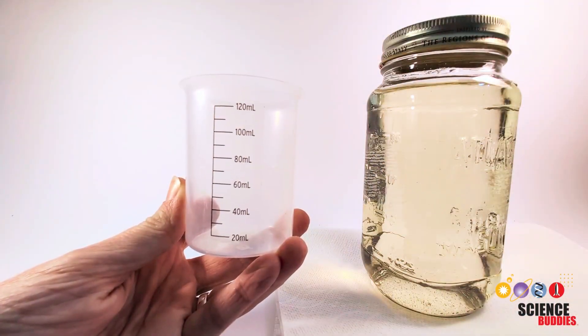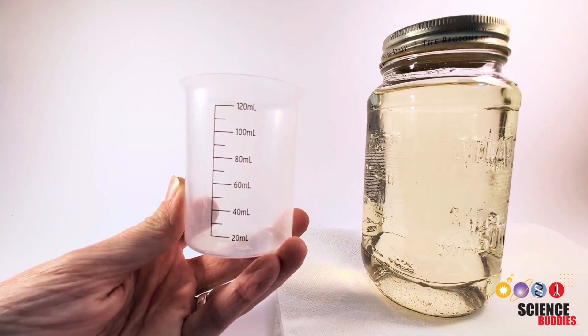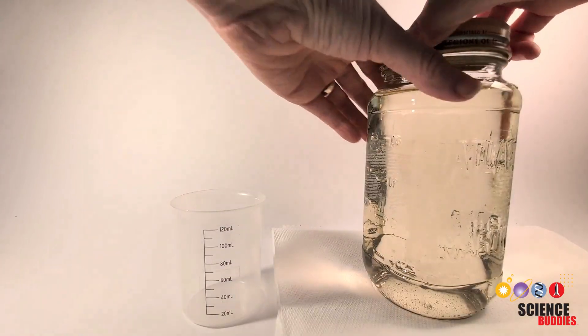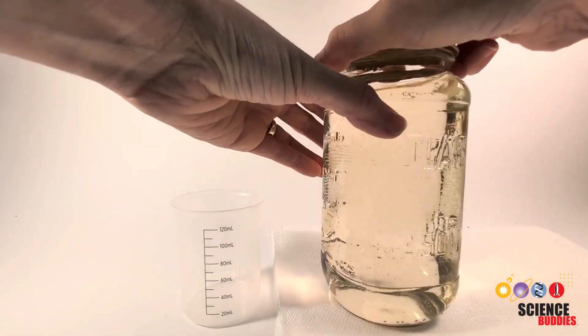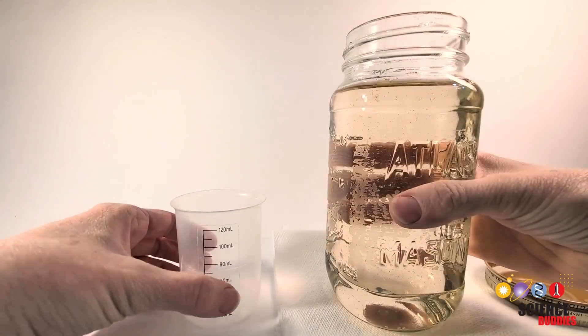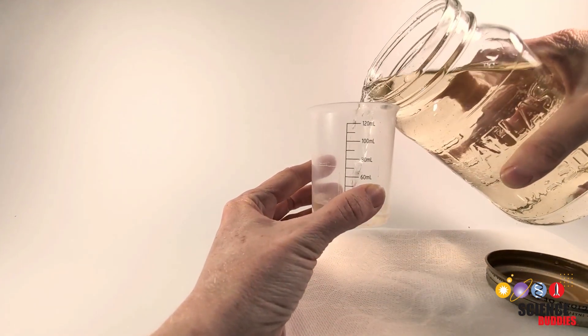You've got your water sample, and what you want to do next is fill up each of your containers with the same amount of that sample. We're going to use about 100 milliliters, which is about the same as 0.4 cups. The important thing is just to fill them all with the same amount. You want to mix up your sample a little first in case things settle to the bottom, and then remove the lid and carefully pour out to 100 milliliters.